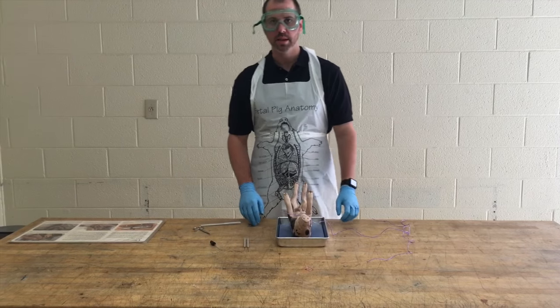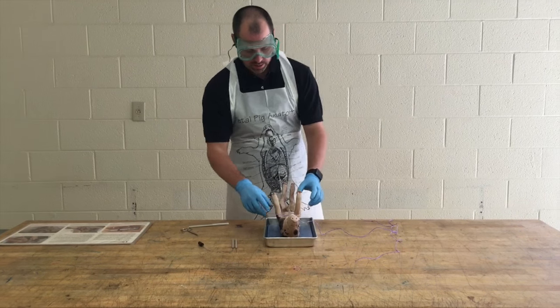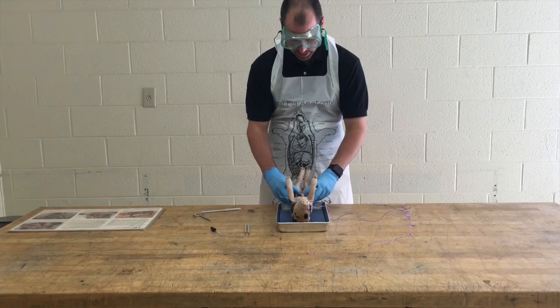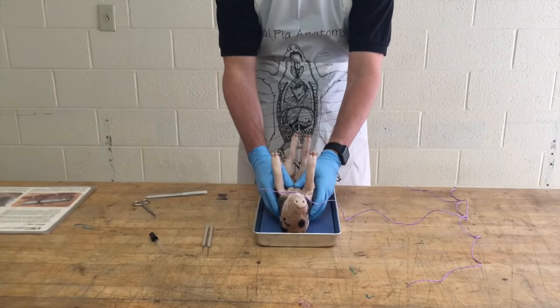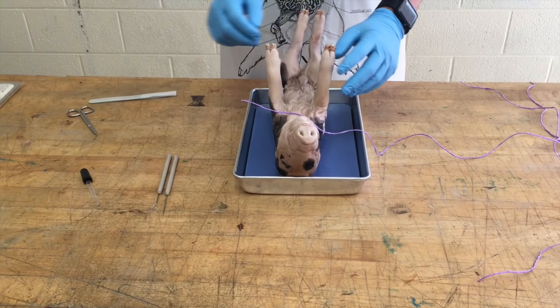The second main step is we need to secure our specimen — the fetal pig — to the pan. To do this, we're going to lay the fetal pig on its dorsal side, which is the back, and expose its ventral side, which is the stomach, so that we can make our dissection.